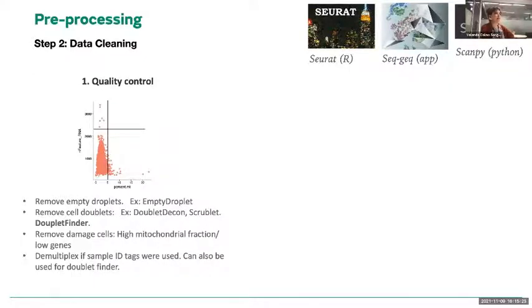And it predicts, based on the number of genes, where the dropout is. It basically aligns all of your barcodes based on the number of genes. When there are real cells, they usually all have about the same number of genes, and then there are suddenly some barcodes that start dropping in the number of genes, and it estimates where to make the cutoff to say, oh, these are empty drops and these are drops with cells.